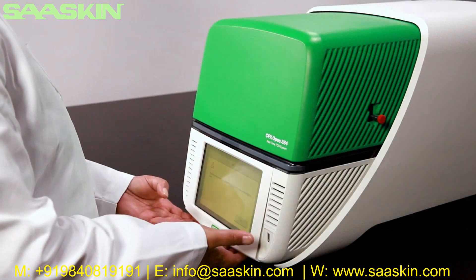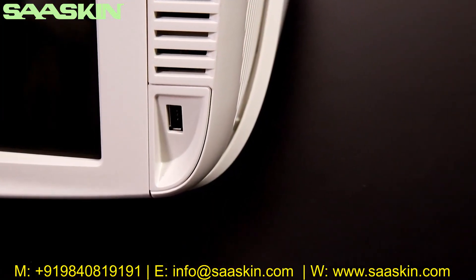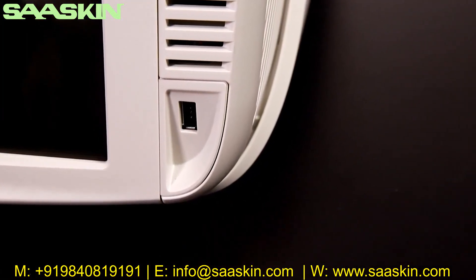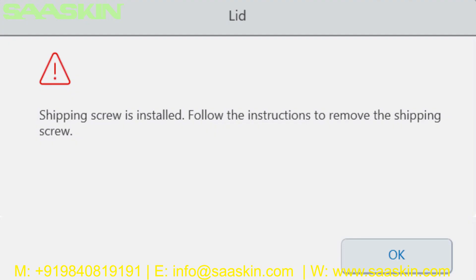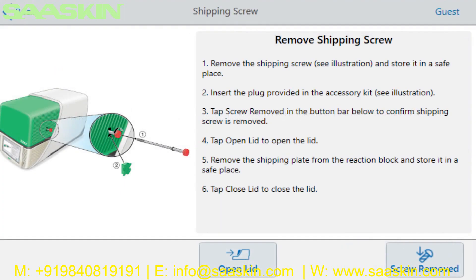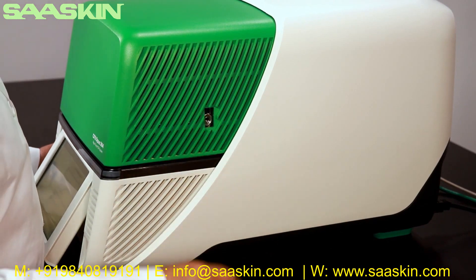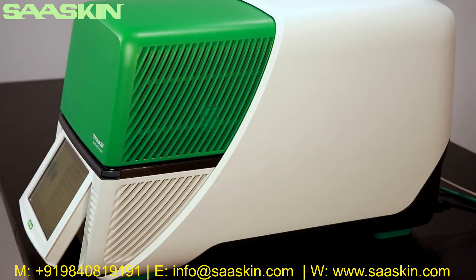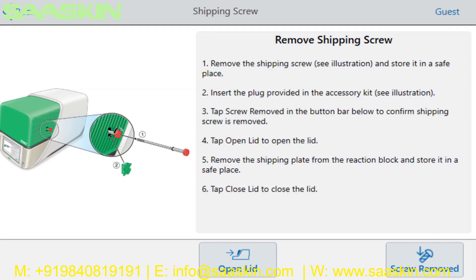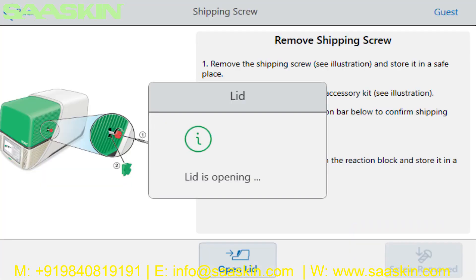Power on the instrument using the switch at the rear left-hand side. Adjust the touch screen to a comfortable viewing angle. Note the USB port near the screen for transferring data and protocols. The screen will display a warning about the installed shipping screw — press OK to view removal instructions. Remove the shipping screw by turning counterclockwise until it can be pulled out, then use the shipping plug to cover the hole. Press 'Screw Removed' on the touch screen to confirm.